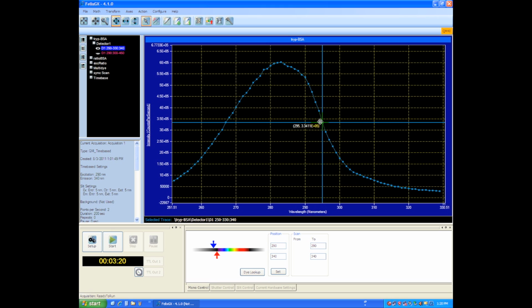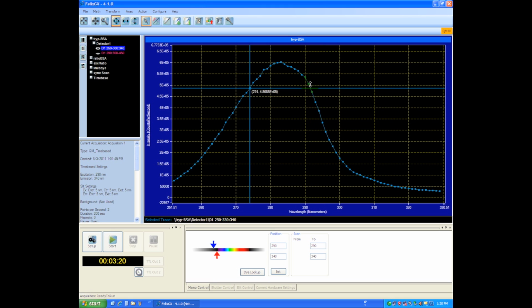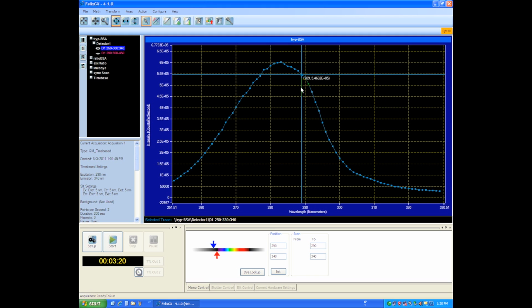In order to move it, you have to go in, and you can move it in the Y direction, or you can move it in the X direction, sorry. And if you click right in the center, you can move it in X or Y. So you can move that data cursor to any point that you want, and then you can see the actual XY coordinates.